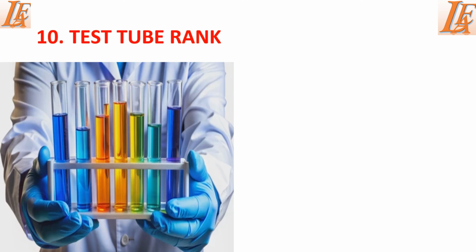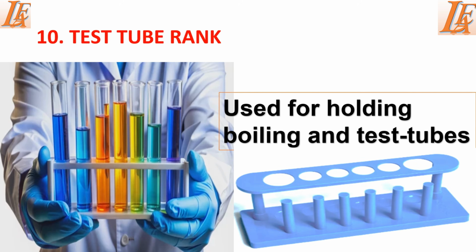Another apparatus is a test tube rack, and a test tube rack is a stand which is usually made of wood, plastic, or even metal, and it has holes. Now these holes hold the test tubes and boiling tubes upright, and the essence of holding them upright is to ensure that they are organized, and it prevents them from rolling or breaking, and sometimes it helps in safe handling of these apparatus during the experiment.